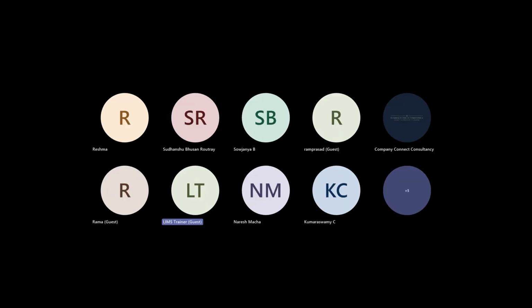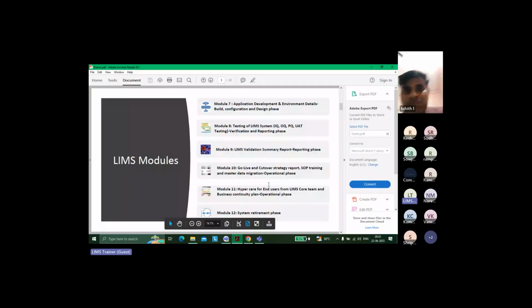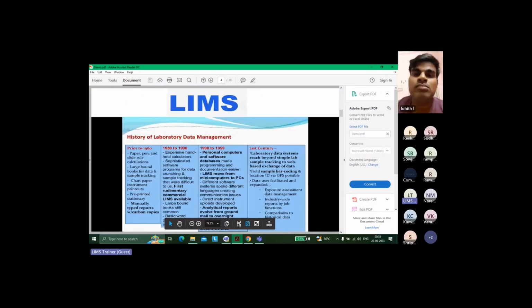See, this is one requirement of LIMS. So that's what I'll answer your question, okay? But my first question to all of you, those who have experience in LIMS, can any one of you define what LIMS is? Any one of you?